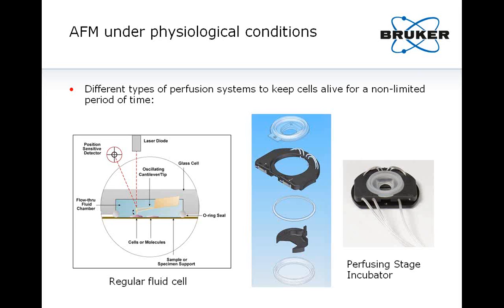Basically, you have on the top of the dish a first plastic holder, this black stuff, that connects to the second holder, which is magnetic. So this one is attaching the system to the XY stage, the AFM stage. And this one is equipped with inlets and outlets for gas and liquid. So normally when you work on living cells, gas will be a blend of oxygen and carbon dioxide, and liquid can be culture medium or any mixture you can use to work on the cells.